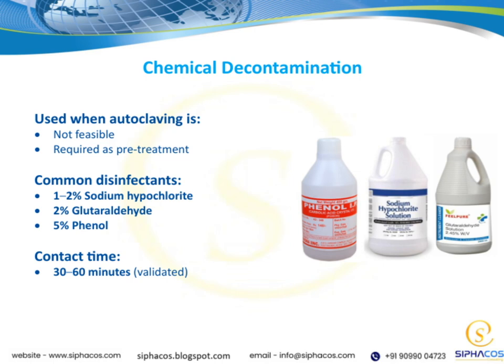Some common disinfectants we rely on include a 1 to 2% sodium hypochlorite solution, which is essentially a diluted bleach, a 2% glutaraldehyde, and a 5% phenol solution. These agents are effective at reducing microbial contamination when used correctly.